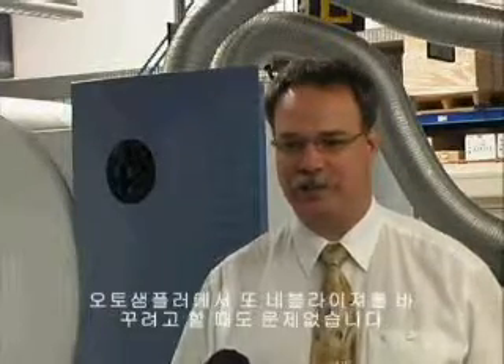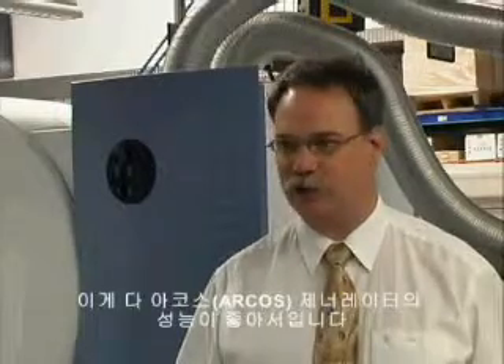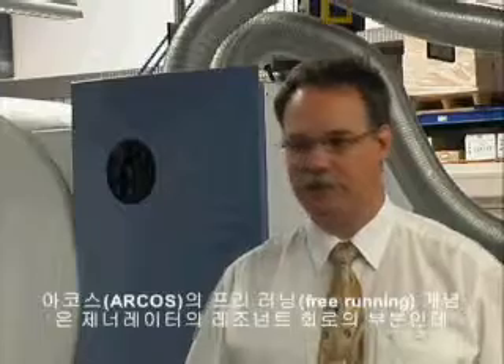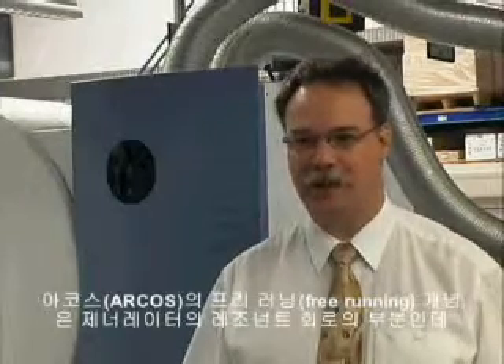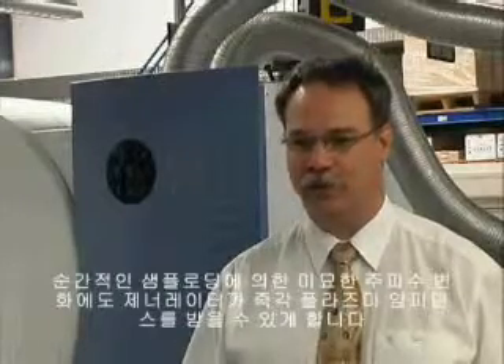Or you want to change the nebulizer, stuff like that. And that's mainly caused by the ARCOS generator being a free-running generator. The free-running concept, with the plasma being part of the resonant circuit of the generator, allows for the generator to instantaneously adapt by a slight frequency change to the momentary sample load of the plasma impedance.